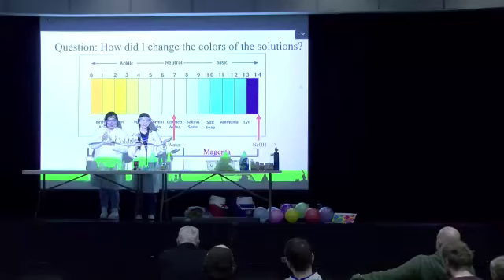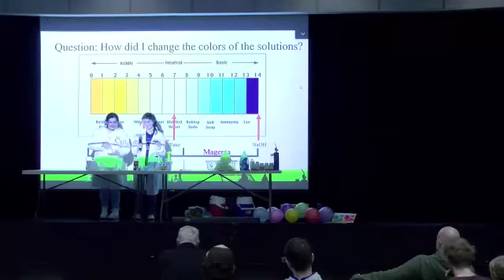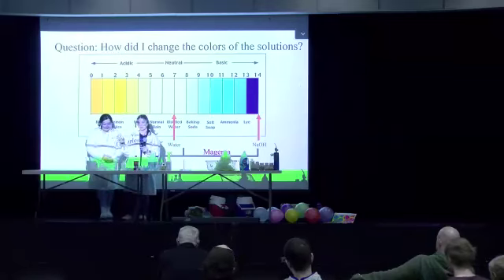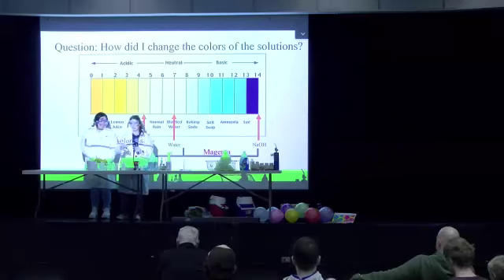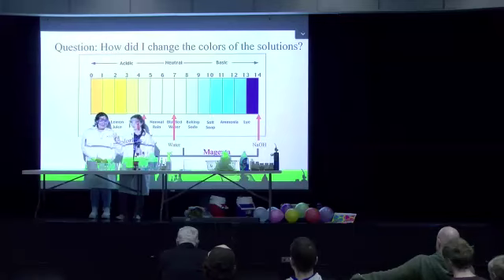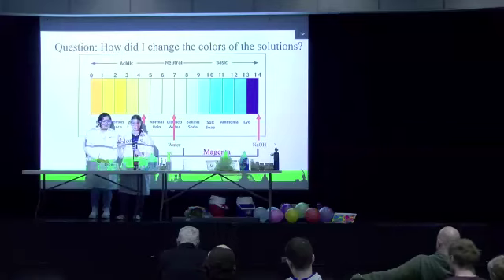All right, I'm gonna let you guys in on a secret. These are not magic beakers. What we started out with was actually just normal water. I was not lying to you about that one. But in all of these other beakers, the first one had a little bit of sodium hydroxide in it. So the sodium hydroxide started to react with the water, but it stayed clear. It didn't have a color change reaction. But when we put it into the next beaker, which had phenolphthalein in it, the phenolphthalein reacted with the sodium hydroxide and the water together and made a pink color.